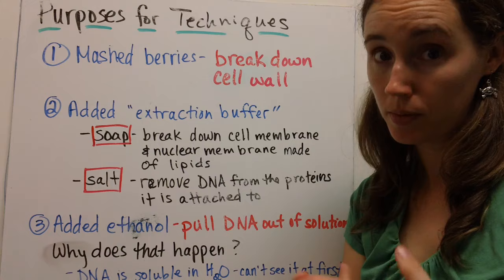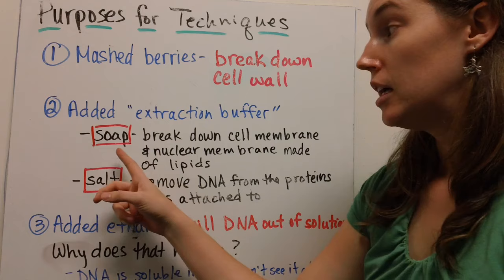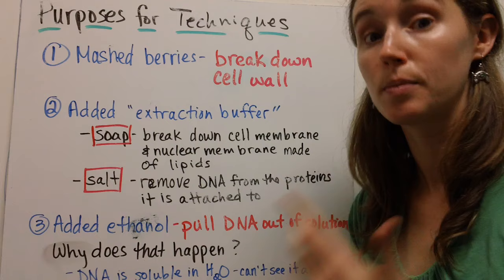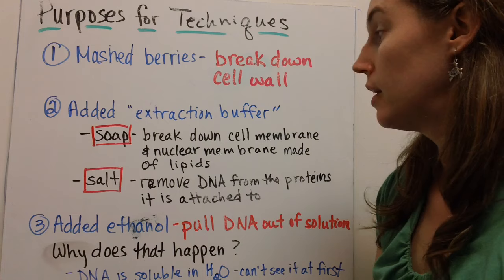So the dish soap prides itself on cutting grease and breaking down grease. Well, grease is a lipid, just like the lipids that make up the membranes of our cells and of the nucleus. So the soap's job was to break down the membranes of the cell and the nucleus. Next was the salt.